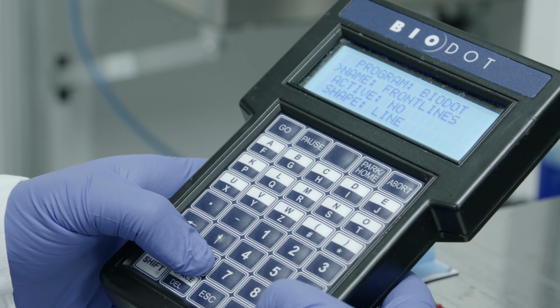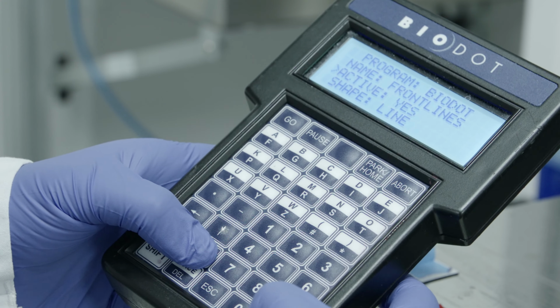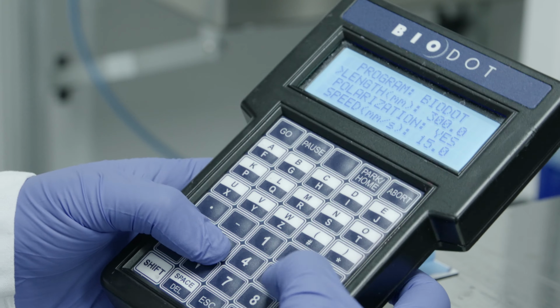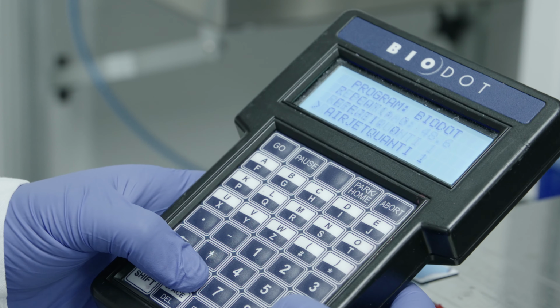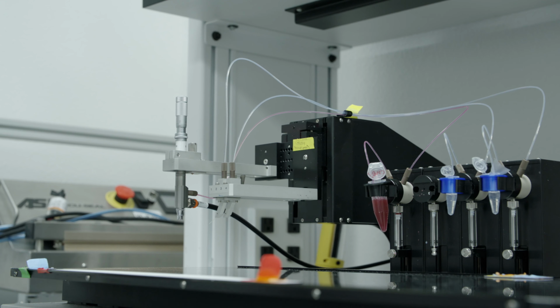And here you can designate the X, the Y, and the Z of these needles right here. First, I want to select the dispense pattern. So I'll select front lines since I'm striping the membrane. And I'm going to go through each parameter and make adjustments accordingly. And then I hit go.